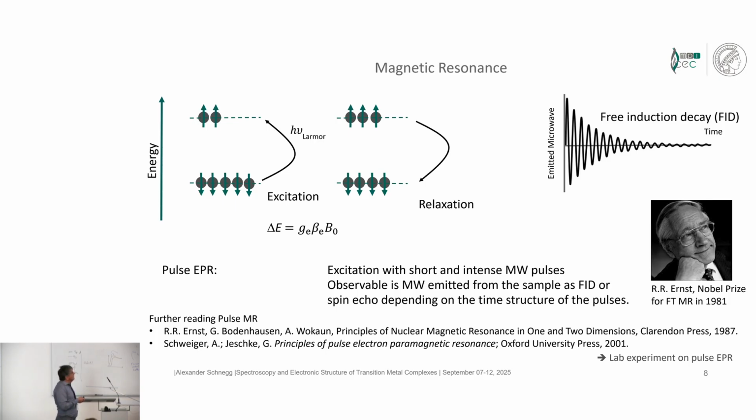And by measuring this signal and Fourier transforming it, one can obtain a magnetic resonance spectrum. This is what is done in NMR. All the NMR machines, even the tabletop ones nowadays, which we are using, are measuring either echoes or free induction decays, applying a Fourier transform, and zack, you get the spectrum. This is very convenient, doesn't need any field sweeps, is super fast.